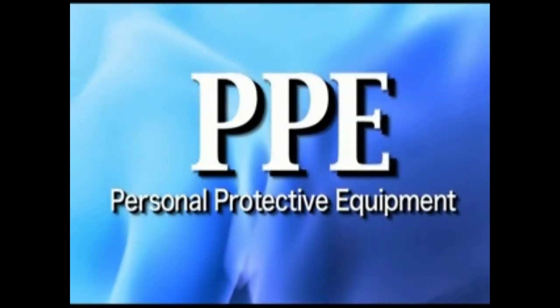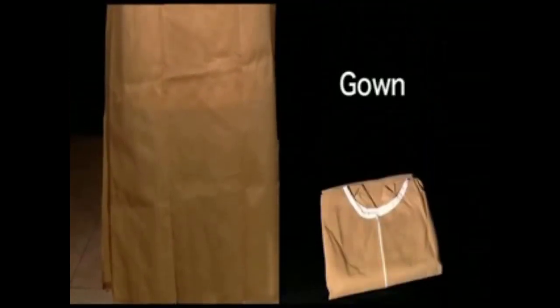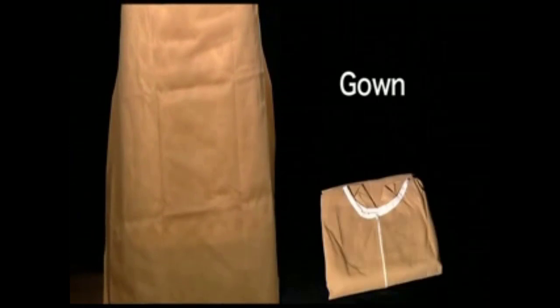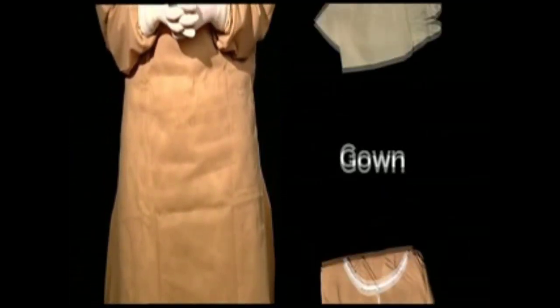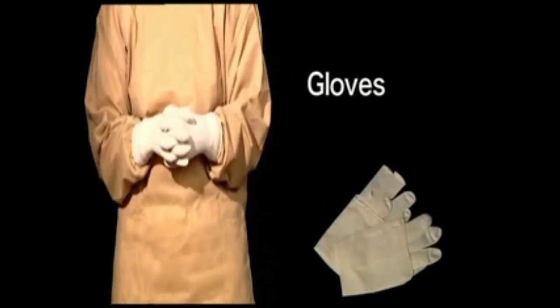Personal Protective Equipment, or PPE, refers to highly specialized clothing or equipment for protection against infectious materials. Medical workers who work in close proximity with cases that are either carriers or suspected to carry infection are recommended to wear PPE for protection to ensure complete safety.